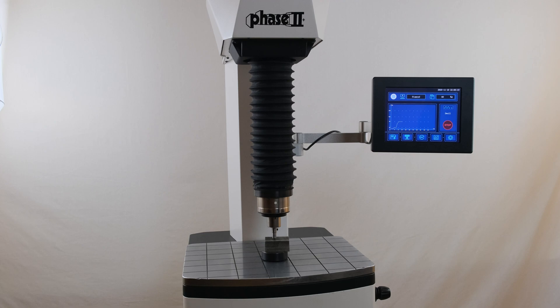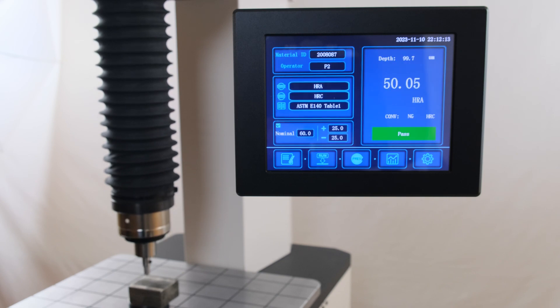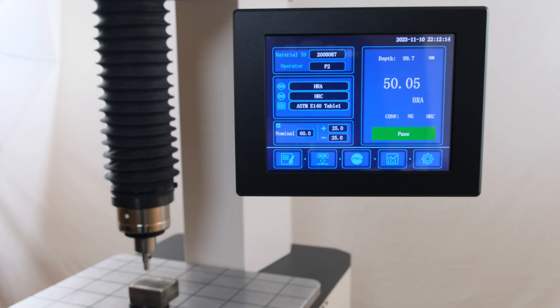Throughout the test period, the test run menu will allow the operator to view what forces are being exerted on the part. Following the completion of a test, the third previous run menu will be displayed. Results will be automatically generated with the review of the testing parameters set for the test.